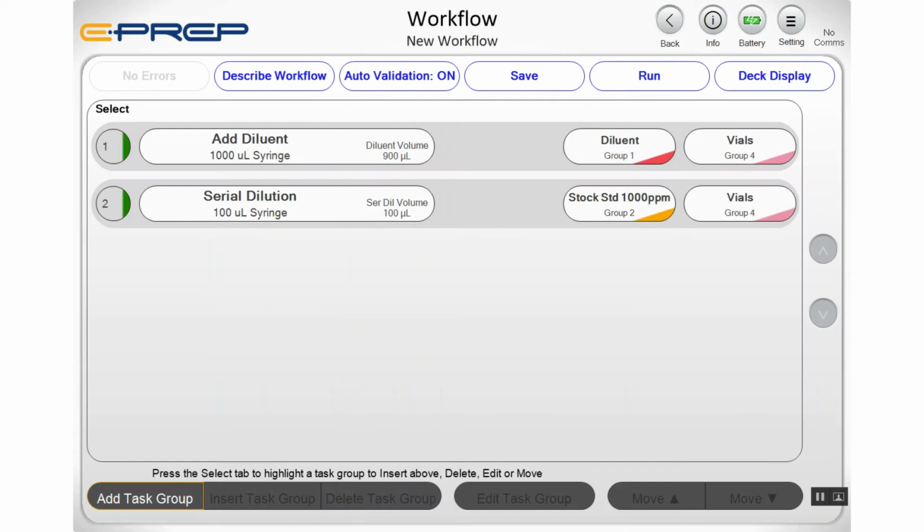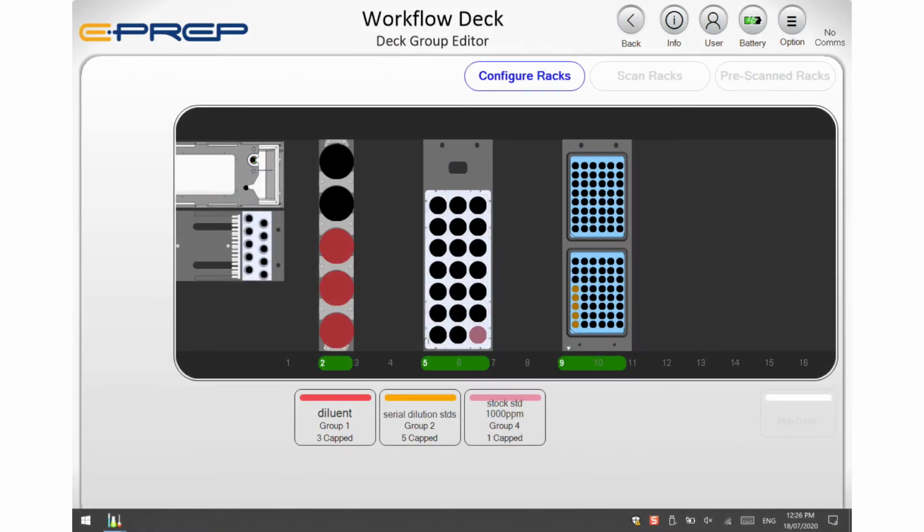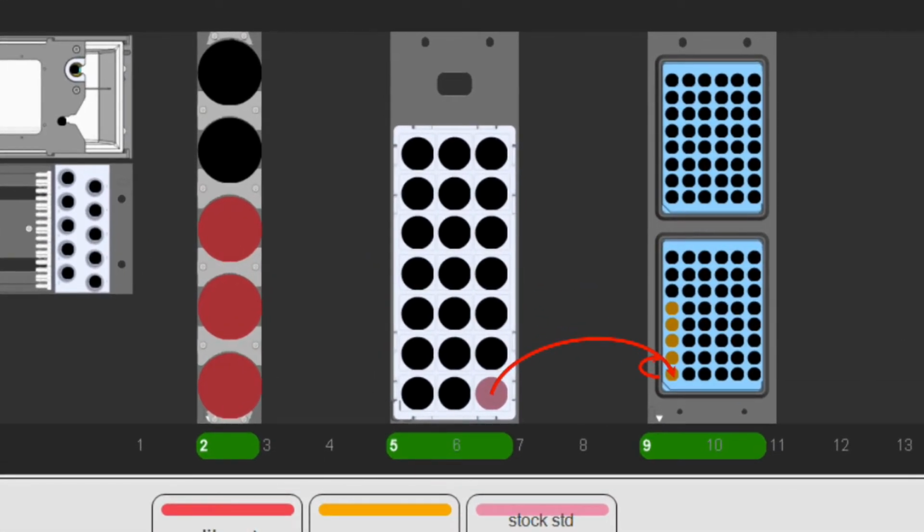The serial dilution task can be used for making up an exponentially decaying set of calibration standards. For example, a series of vials should be preloaded with a solvent solution using AddReagent. A defined volume of a reagent or standard is dispensed from an input tube to the first vial in the series. The same volume is then aspirated from this vial and transferred to the next output vial in the series. From the second vial, the same defined volume is then transferred to the third vial in the series and continues down the defined number of output vials.